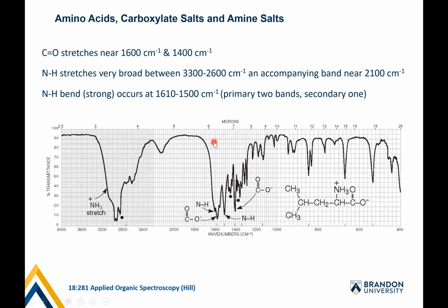So I think that's all I really wanted to say about that. I'll dig one up and we'll use another example of one from the database, and we'll see that you do get very broad peaks, which is a good hint of what it actually is.